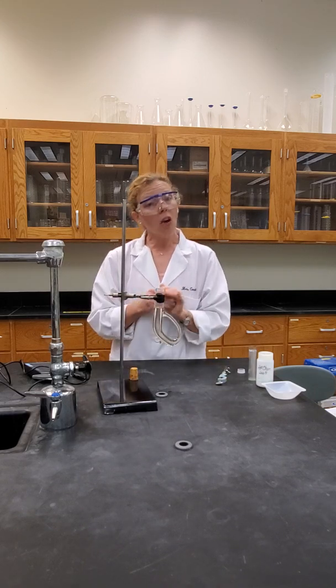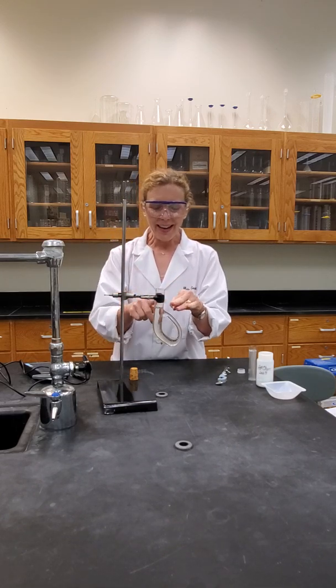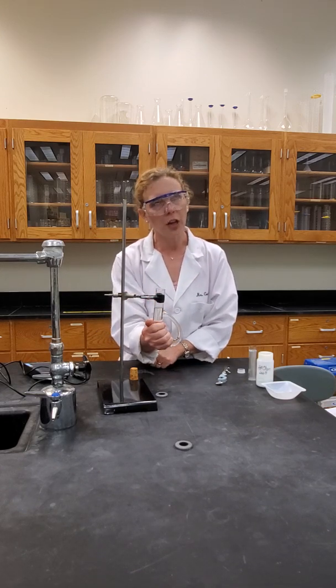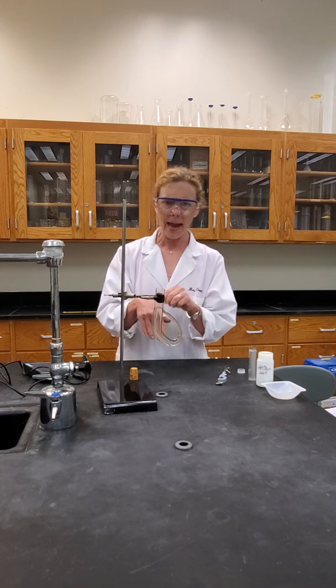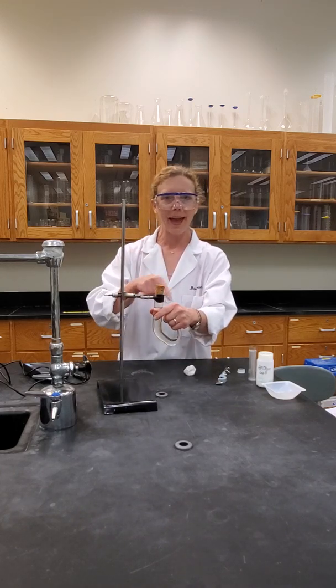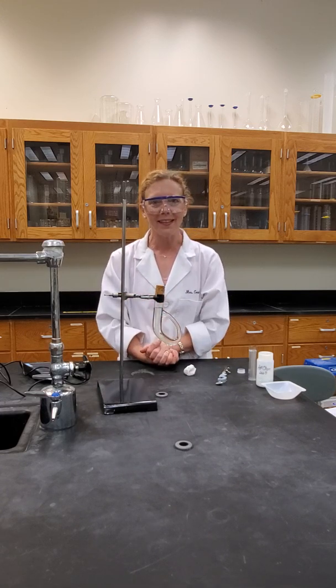Now, depending upon your compound, you may have to really increase the temperature. We shouldn't put the cork back on until this is cool enough to touch. Now, please don't touch it to check if it's cool enough to touch. Put just your hand close and just listen to that inner voice that's saying, oh yeah, if you can touch it, or oh, don't. Do not worry. If you need me to place these away for you, I definitely will later. But once it's cooled down enough that it's still maybe warm but safe for your skin, place that cap back on, undo this, and place it back in the container I use to hold these.